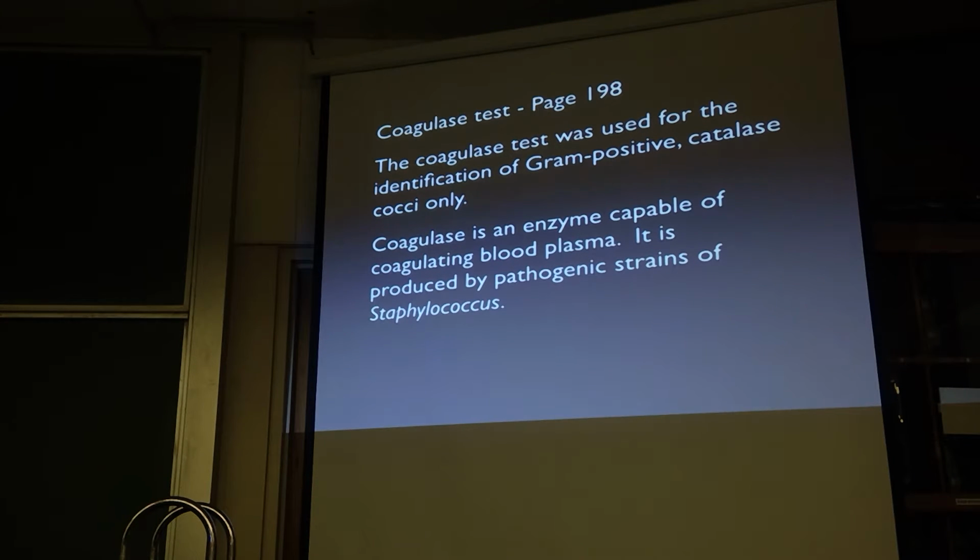Some of you did the coagulase test. By the way, for recording these, it's often useful to put them on a white background and take pictures of them. It used to be students had to carefully draw them out. Now everybody's got cell phones, you can just snap pictures of them. Anyway, the coagulase test was in the little bitty tubes, in that white rack turned upside down over here on the counter.